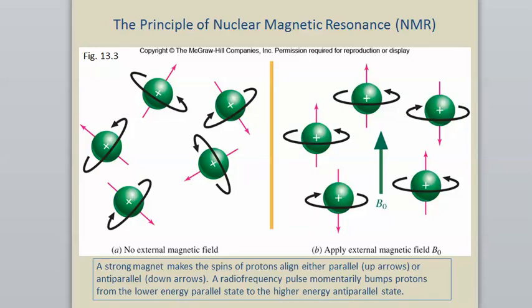Well, the nuclear in the name nuclear magnetic resonance refers to what's going on in the nucleus of atoms, and in particular the nucleus of the hydrogen atom, that is essentially just a proton. So a lot of what we will see corresponds to proton NMR because the nucleus we're interested in is just the one that has just that particle. The magnetic comes in because it involves using very strong magnets, and we'll talk a little bit about what that resonance idea has to do with.